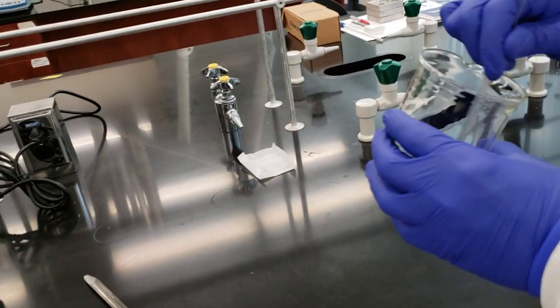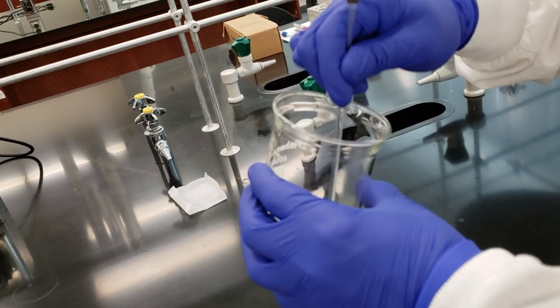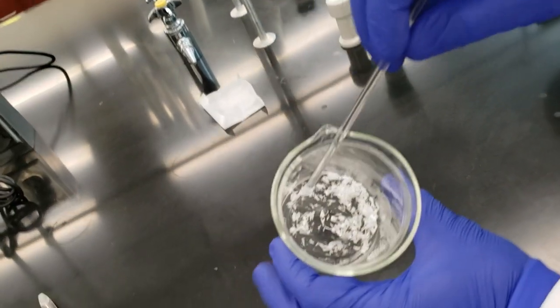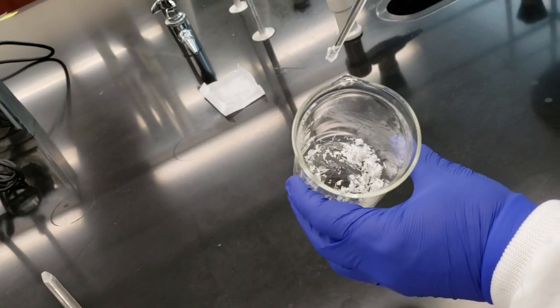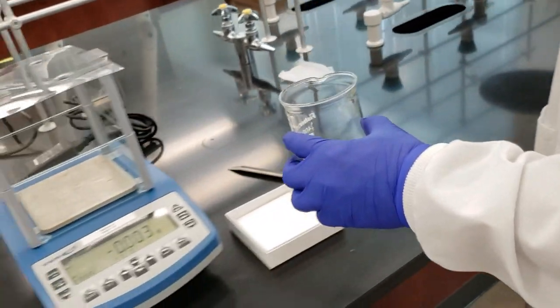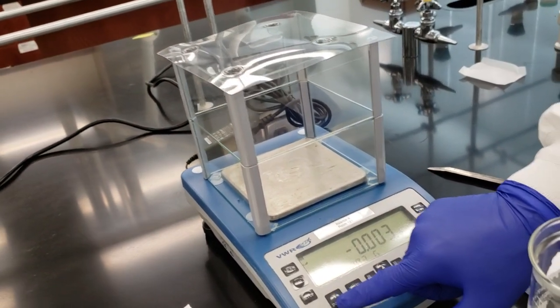These crystals are nice and dry once I scrape them out here. I'll let you see what they look like. They were a little bit wet before. They were sticking to our glass stirring rod, but now we can see that they're nice and feathery crystals that are dry. So let's go ahead and weigh this. We've already weighed our beaker, so we'll weigh them in the beaker here to determine what our final weight is.